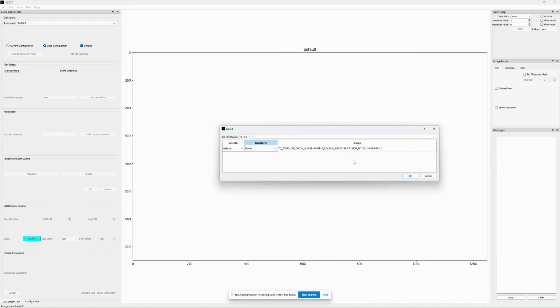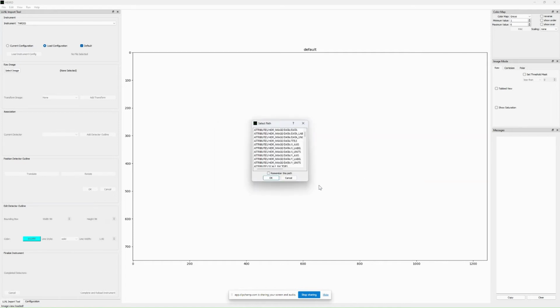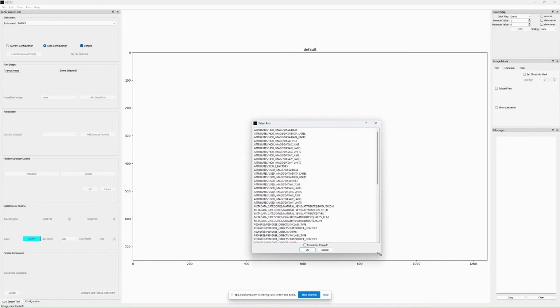Don't worry about selecting that here. Most of the TARDIS data I've seen always has the same sequence of how you do the mirrors, but we'll get into that a little bit later. So once I hit OK there, it brings up another dialog.